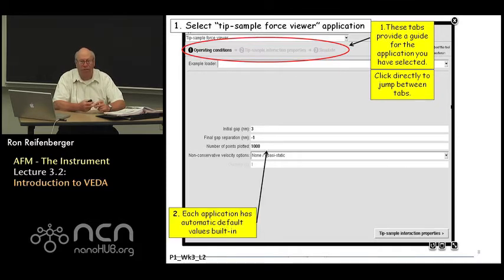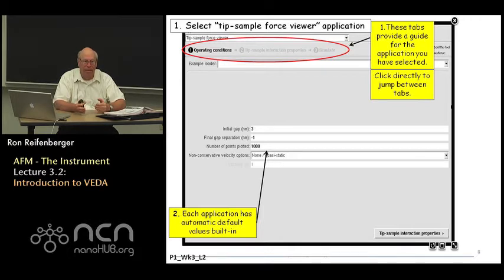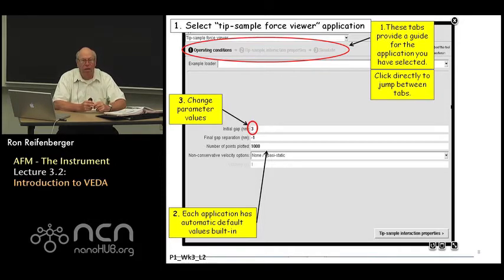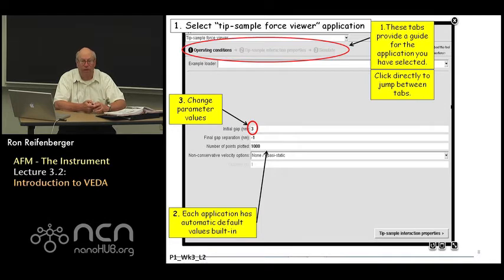The first tab to click on is the Operating Conditions tab. Here you have to specify a variety of parameters — where you want the tip to begin, where you want the tip to end, and how many data points you want to use in calculating the motion of the tip as it moves from its initial gap to its final gap separation. You'll notice that there are already default numbers entered under each application, so if you don't know what to do you can rely on the default numbers until you get a sense of what values are required. You can change these input parameter values very quickly — it's not a problem.